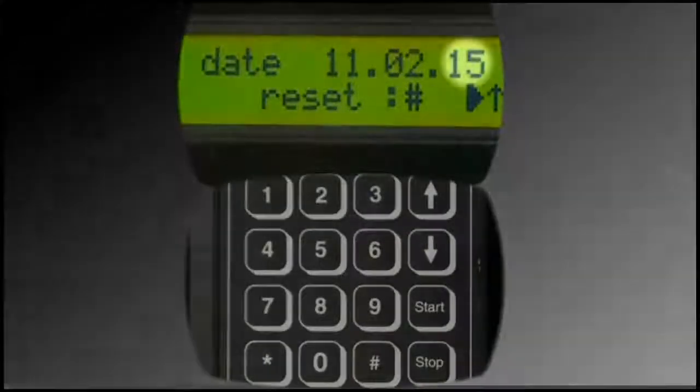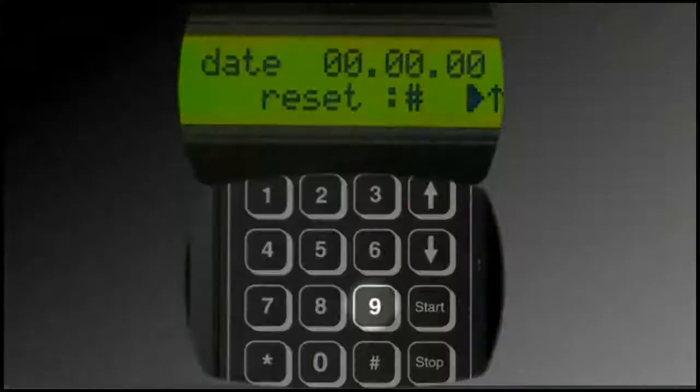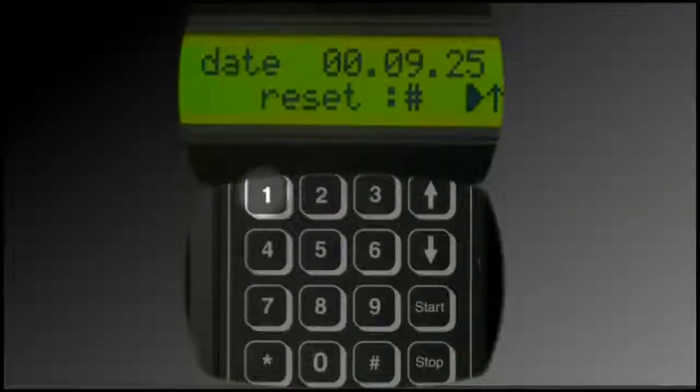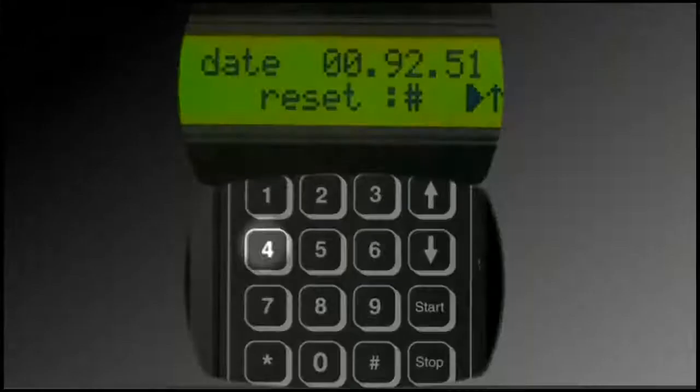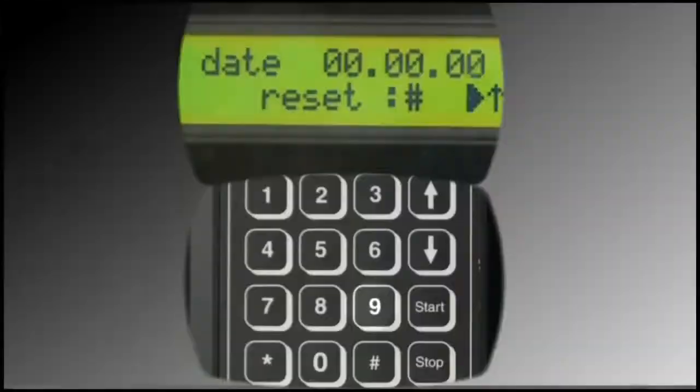Two digits are available for each identifier. Using the keypad, select numbers that represent the date combination desired. Note that the numbers move from right to left on the display when entered. If desired, press the pound button to clear out all numbers, then simply re-enter the desired day, month, and year.